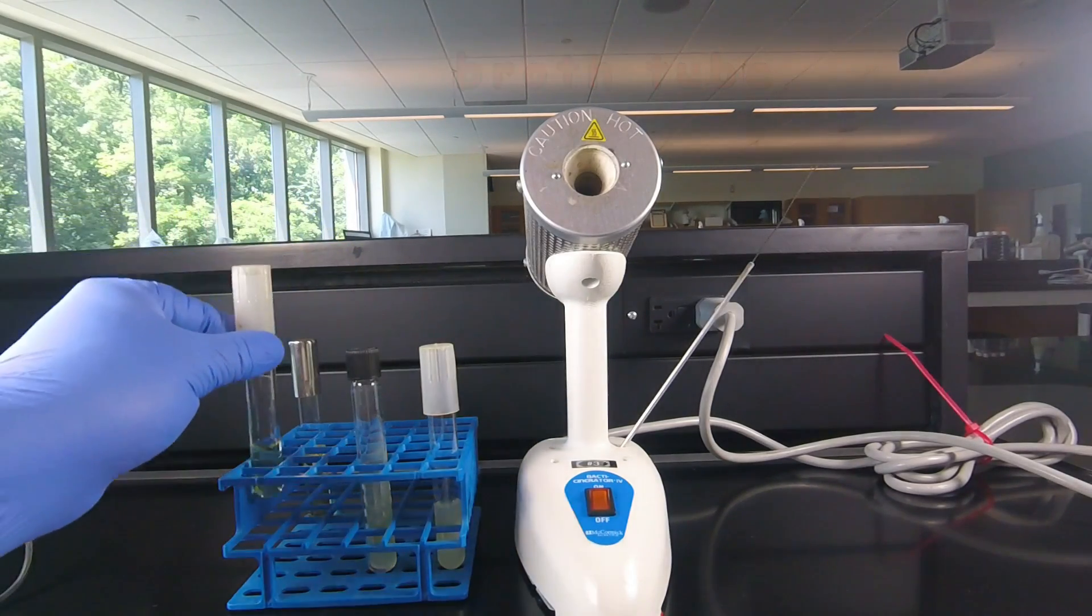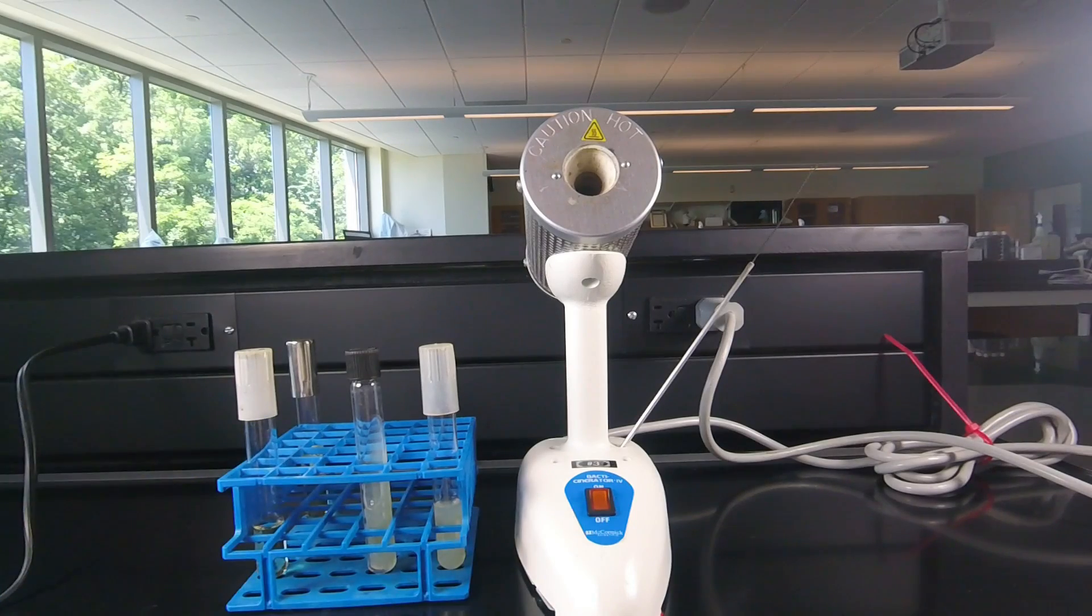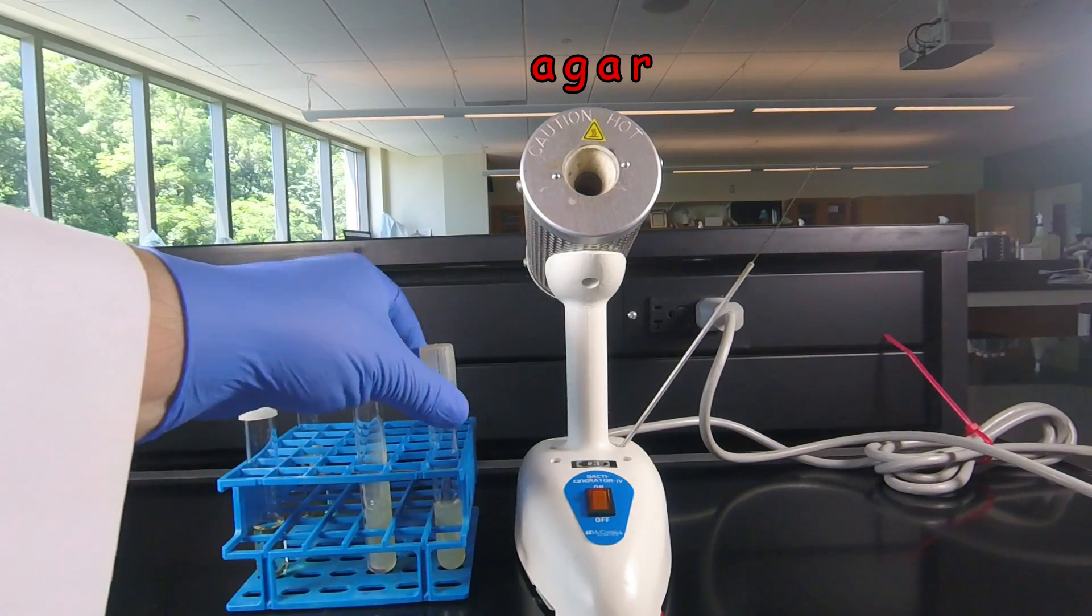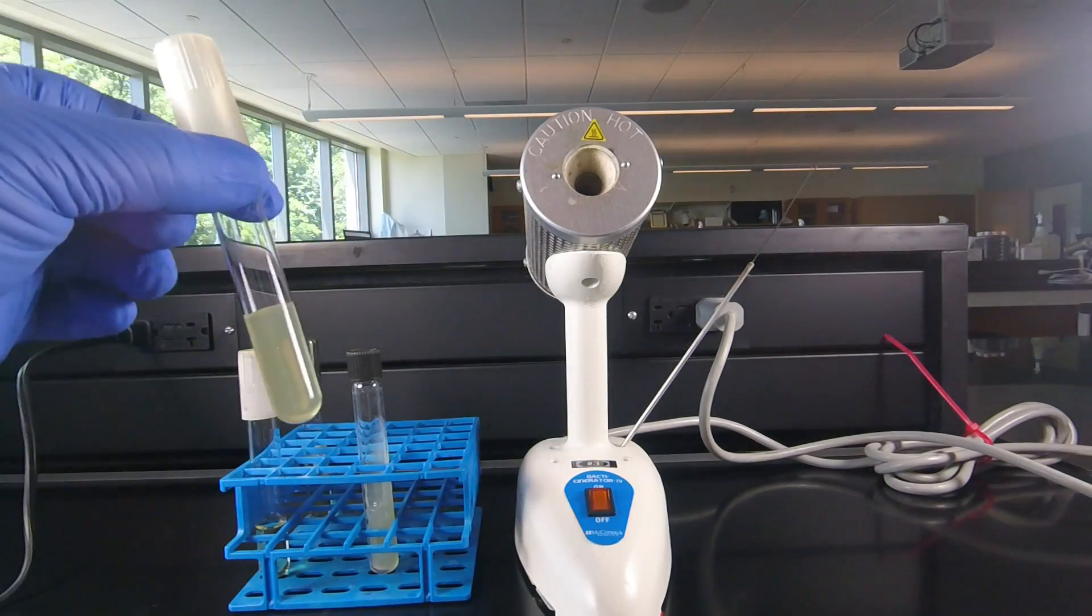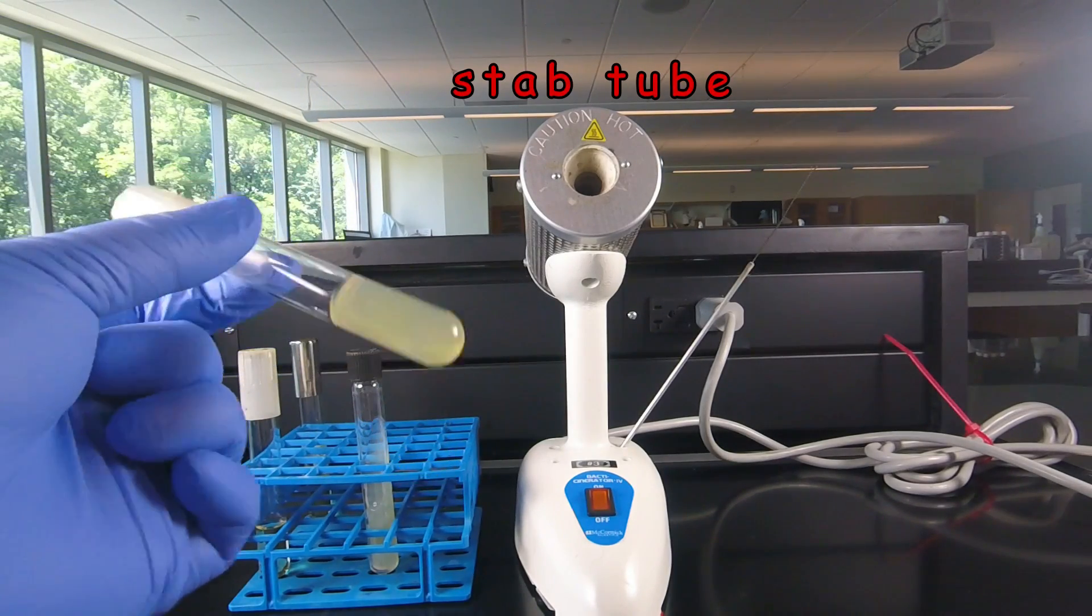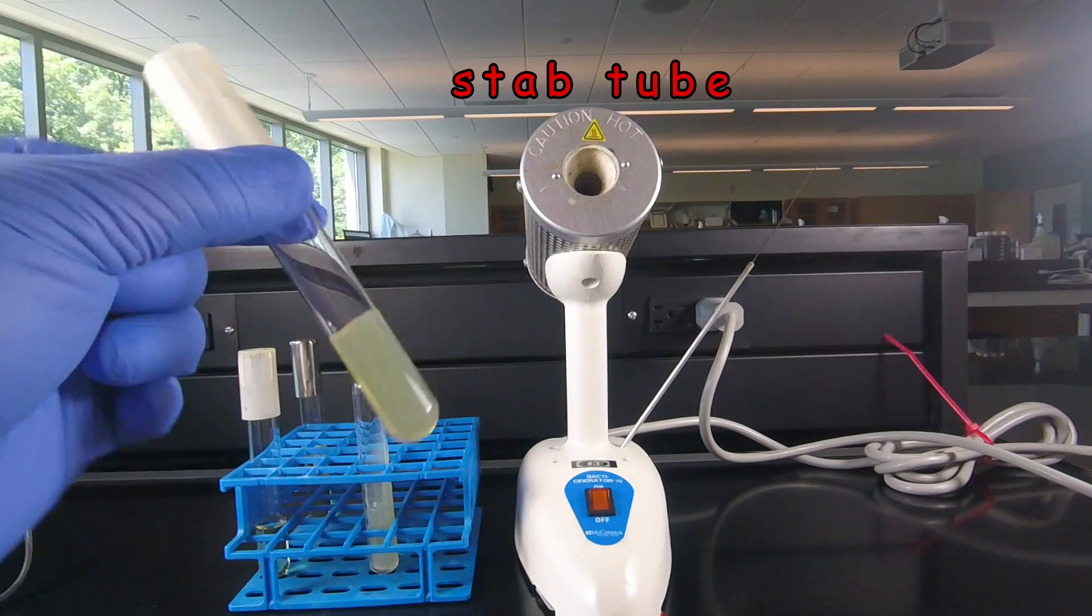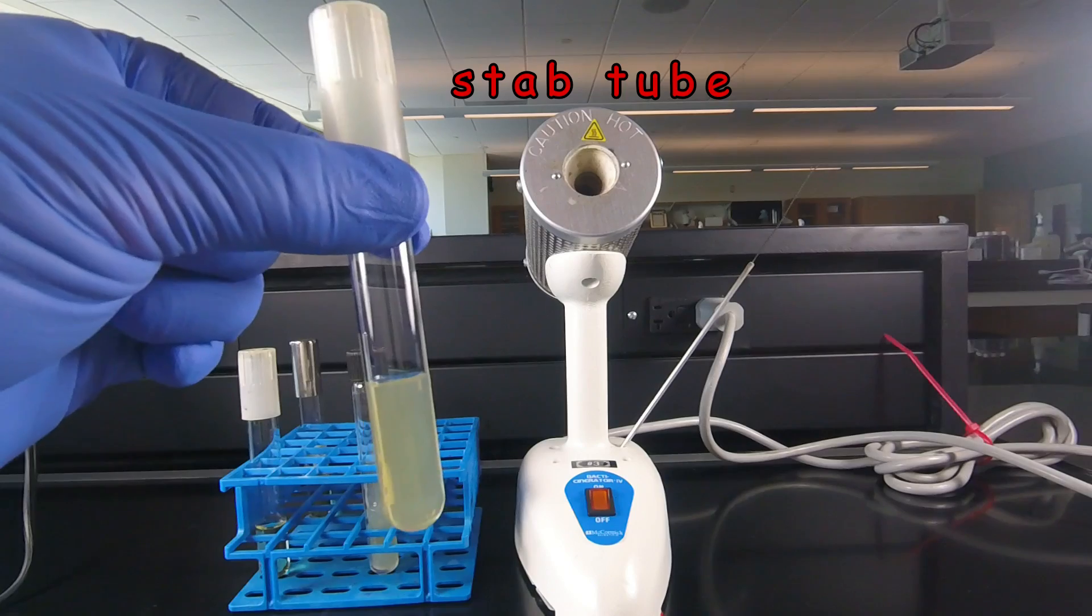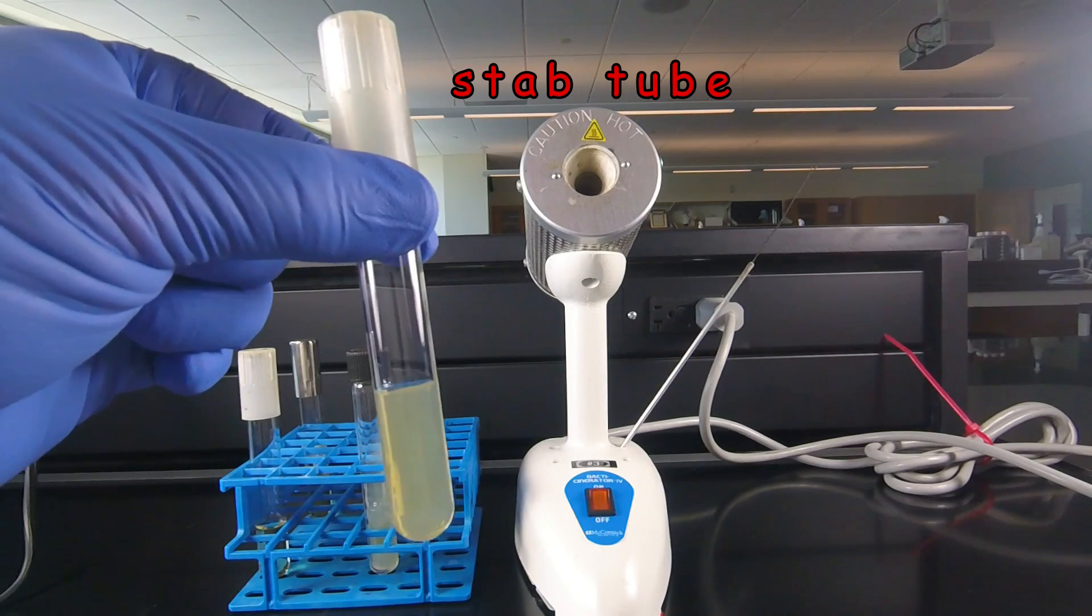We can also grow microorganisms on a solid medium by using a solidifying agent called agar. If we pour the agar in a tube and let it solidify upright, like we see here, we have a nice solid plug of agar that we inoculate by stabbing. So we sometimes call that a stab tube and call the cultures a stab culture.